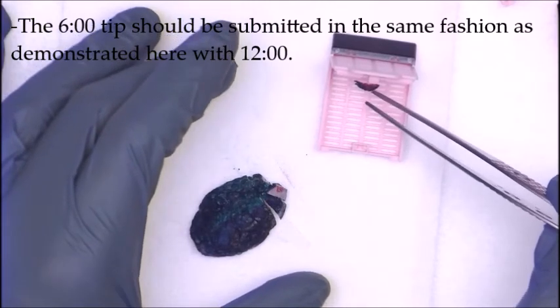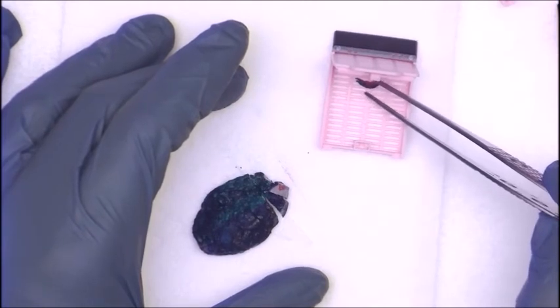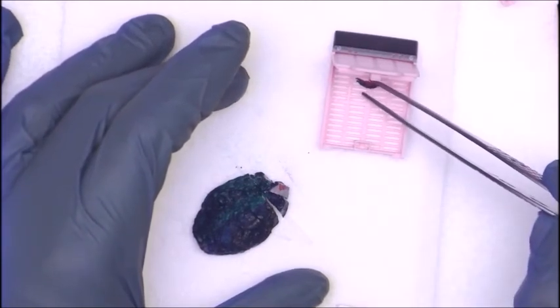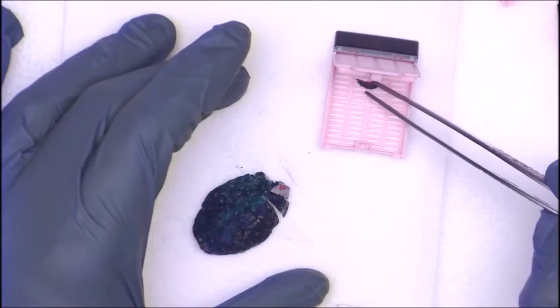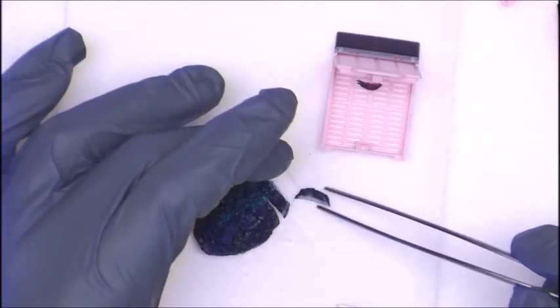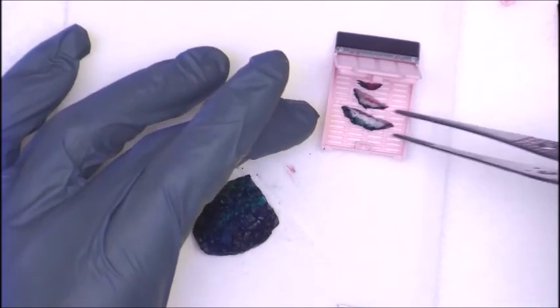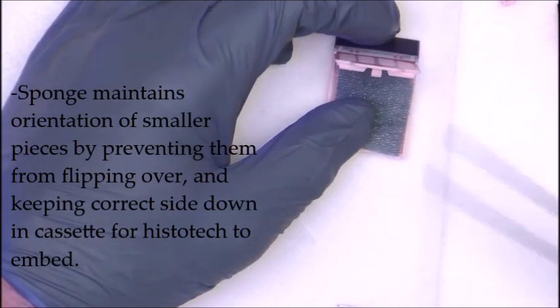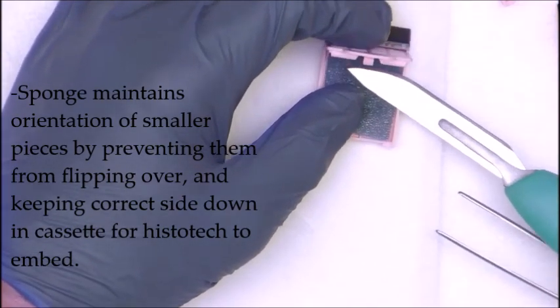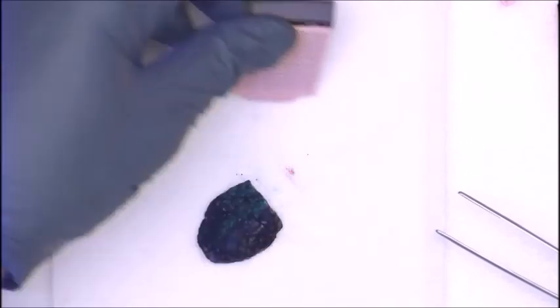Some places may have you put the tip down first, but for our practice, our histology department, we put the cut surface down. Okay, and if it's positive, on their slides, they'll end up cutting through the entire block, or the remainder of the block, to make sure that is a true positive margin. Okay? So, I'm going to put this section in here like this, and then I'm going to put a sponge on top of that. Some people put sponges on the bottom and then put a sponge on top. I like to just put it on top like this, and what you can sometimes do is put your scalpel blade in there to kind of make it flat, and then you can just close it like that, and voila. So here's the first block.